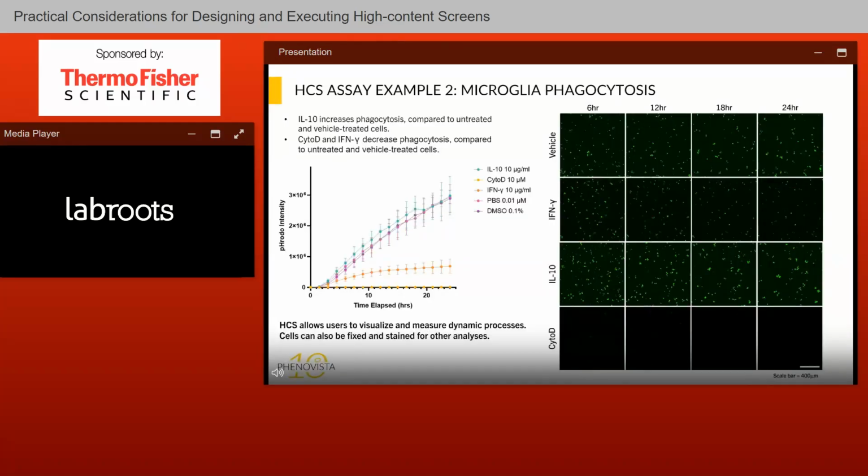And here we have another slide. I guess that just summarizes that you can not only see the trends in the data, but you can also compare and make sure that the images substantiate the data that you're getting, and that you have a good match between what your eyes are seeing in the image and what the numbers are being reported as.